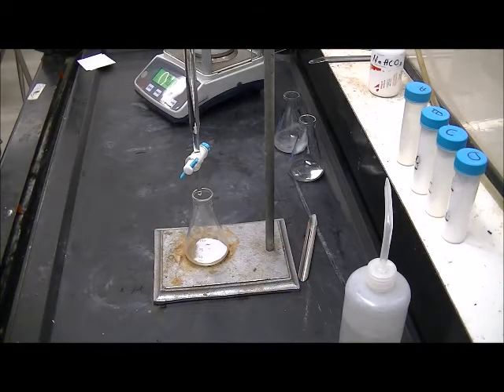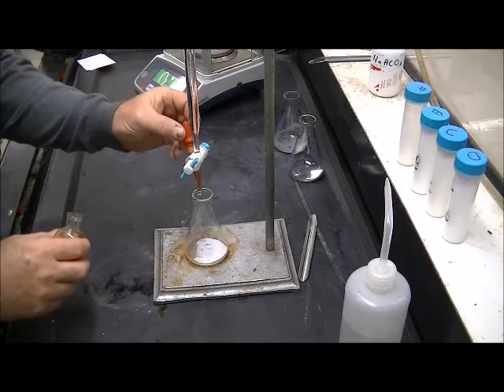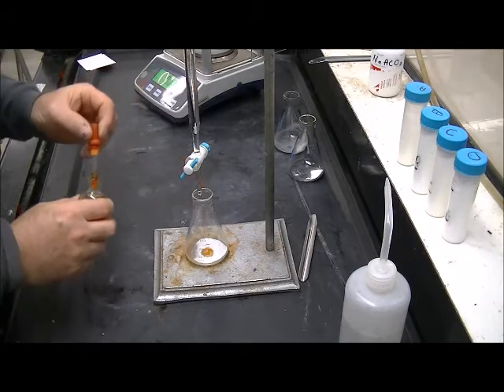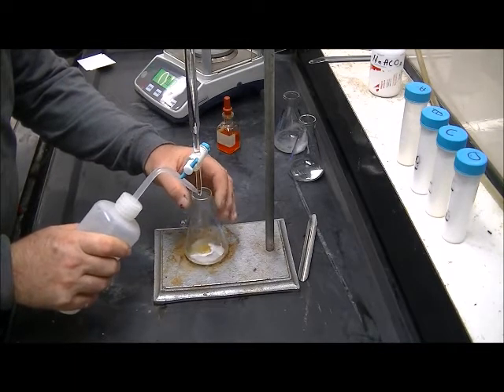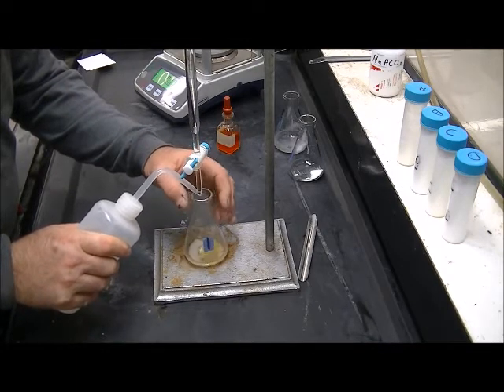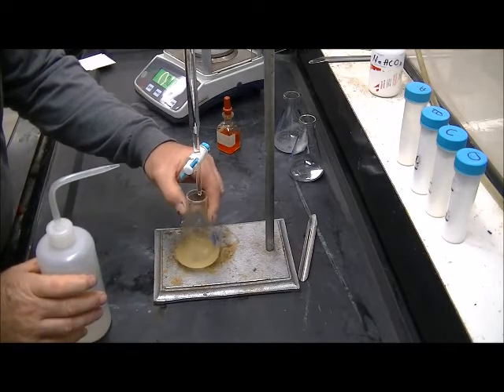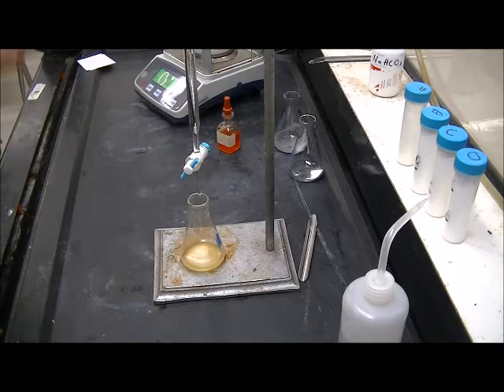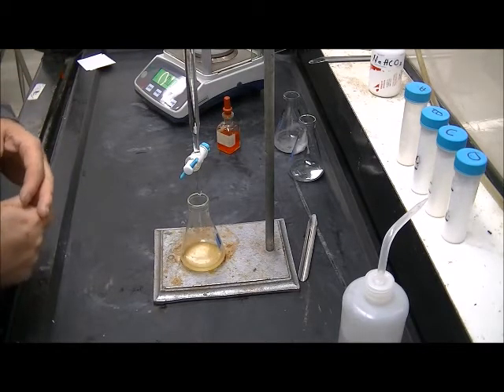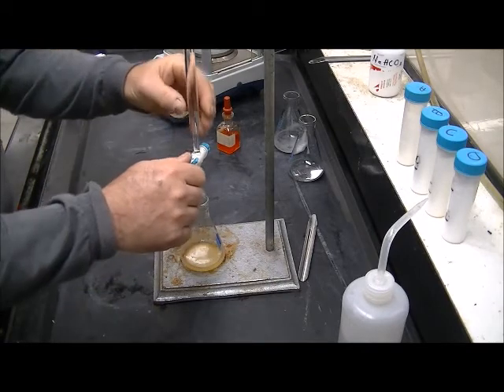I'm going to add some indicator to my flask. Just two or three drops. And then some extra water to help dissolve my solids. And now I'm ready to titrate. I know it should take close to 30 milliliters of the titrant. So I'm going to run the first 25 or so in rather rapidly.